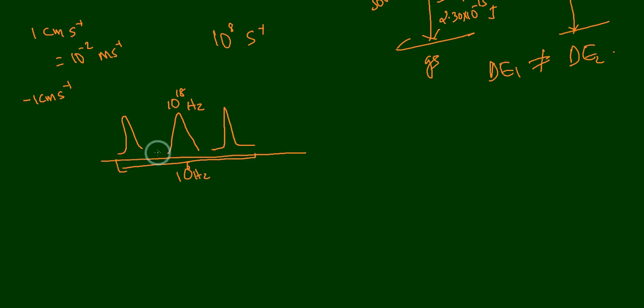So you have to do 100 scans, like 1 centimeter per second, then 0.99 centimeter per second, 0.98 centimeter per second, like that. You can do 100 scans or 200 scans, or you can do 100 scans in both directions, to and fro. Then it will cover the entire region.